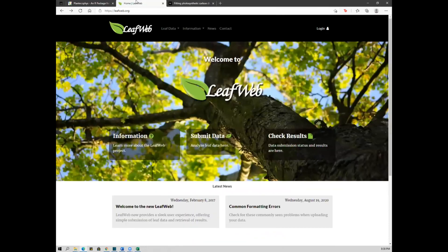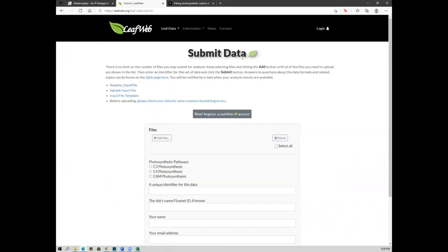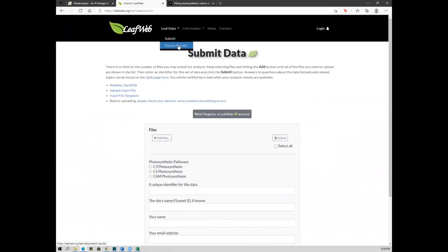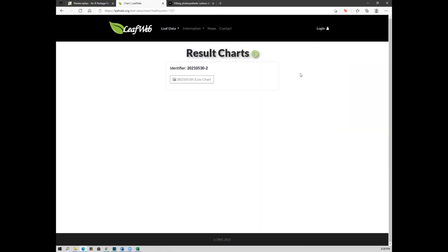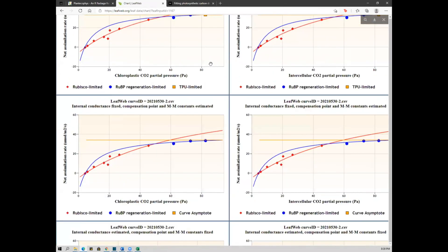The second option is the LEAP web website. You can submit your data and receive the results by email. You will need to process your data according to the site's requirements. You can also view recent submissions, other users' data, and graphs, and download those graphs to compare your data.